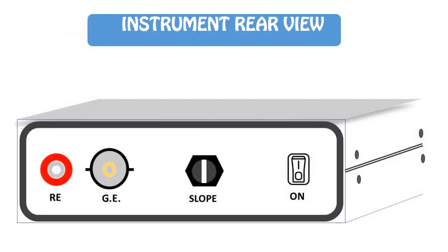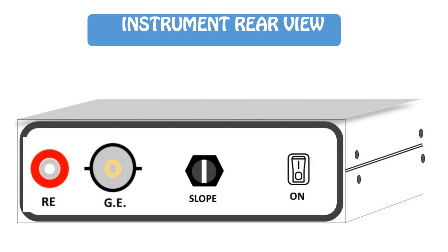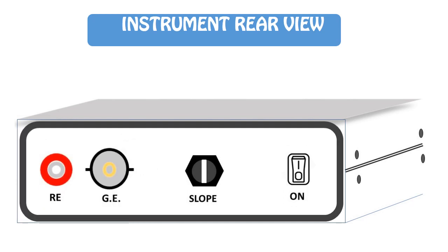This is the rear view of the instrument. You can see the on/off switch, the electrode connecting port, and the slope setting knob.